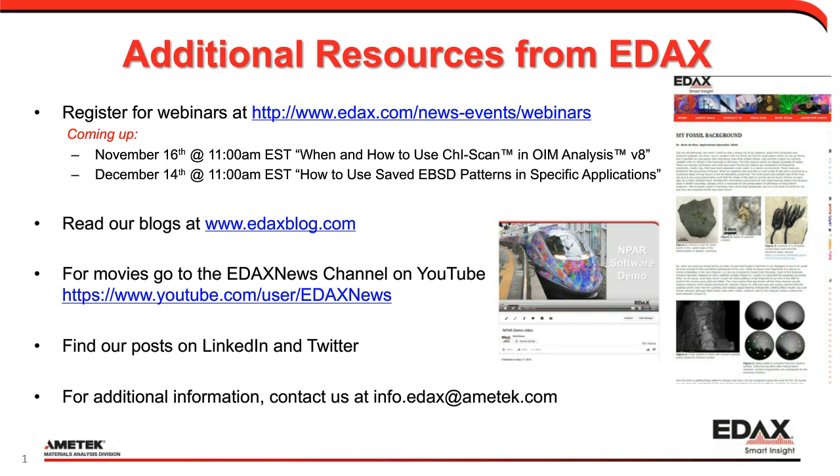Which are the best parameters for improving a quantitative map? Really interesting and good thinking. For those of you who are not familiar, a quantitative map is going to have each pixel in the map quantified and give a display of the atomic percent or the weight percent of a material.